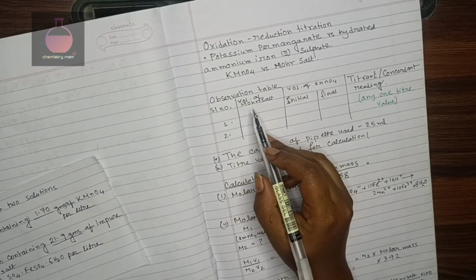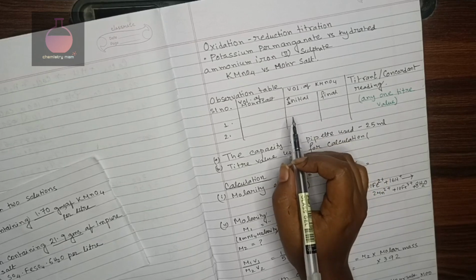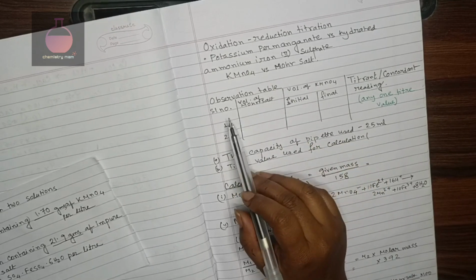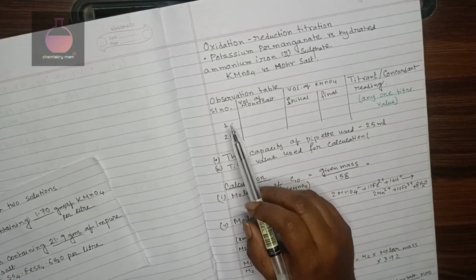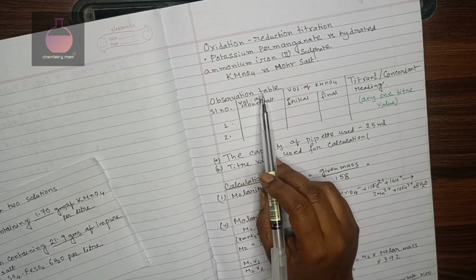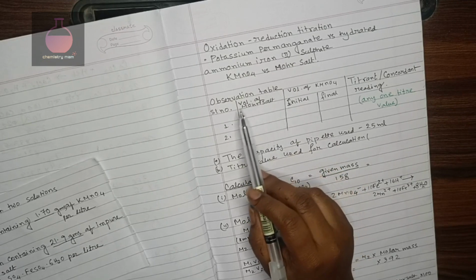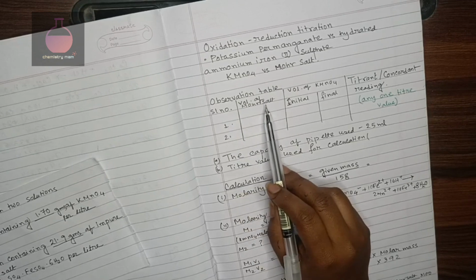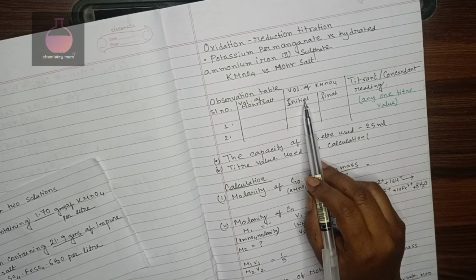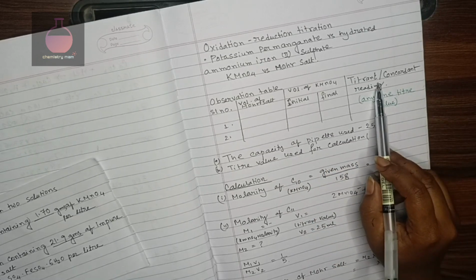So first you need to make the observation table, and this observation table must be filled by your own work only. The observation table will have these columns: serial number, volume of Mohr salt, volume of KMnO4 (initial, final), titre or concordant reading.